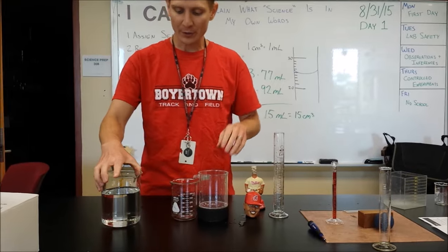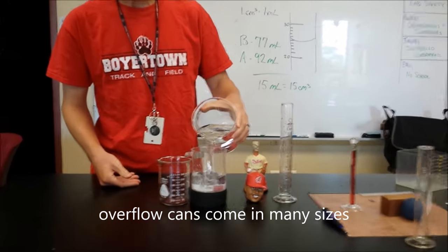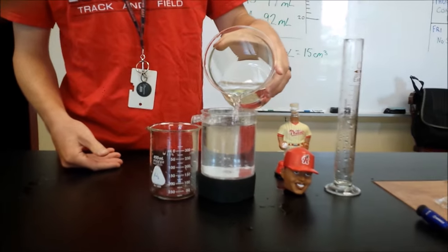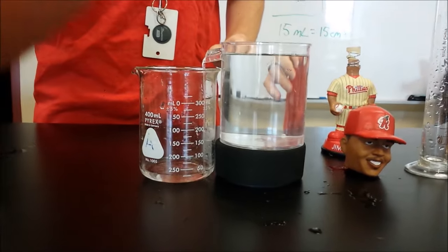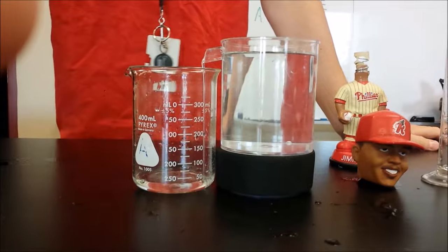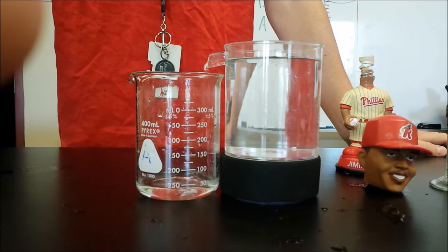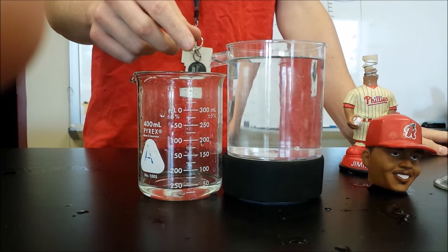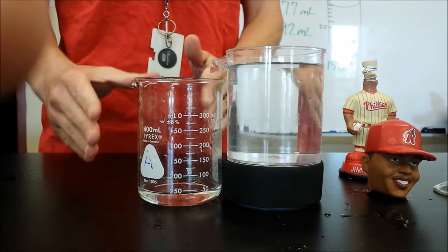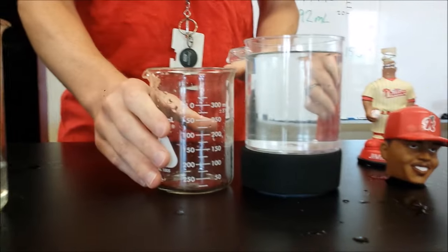Okay? So here's what we're going to do. Here's the procedure. First thing you're going to do is fill up your overflow can until it overflows. It's important. Whatever you caught off that first overflow, you need to discard. You need your catch beaker to be empty. All right, now my catch beaker is empty.